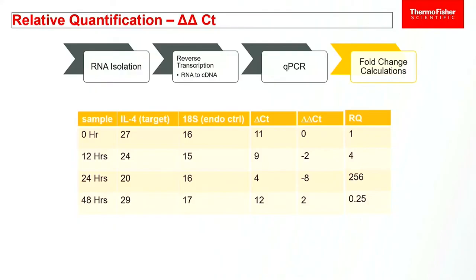We have a fundamentals guide, what do we call it? The handbook. We have a qPCR handbook outside that is a great reference. It's also available online if you want to have this, and it goes into a lot more detail about how to collect and do the RQ data analysis. I think that would be good for you to sit with and understand where I'm coming from. But I think you're doing it the right way. You're just doing that transformation at a different point. But I think we're getting to the same end result.